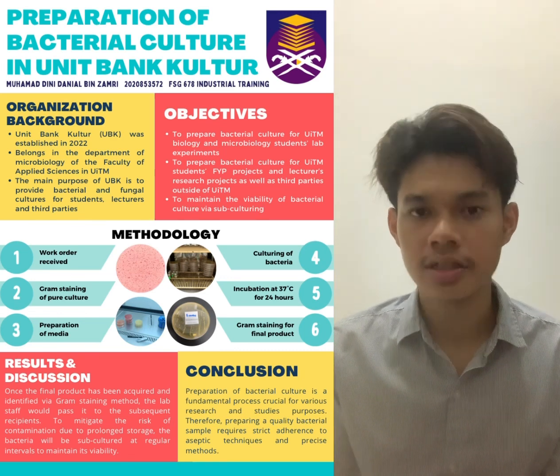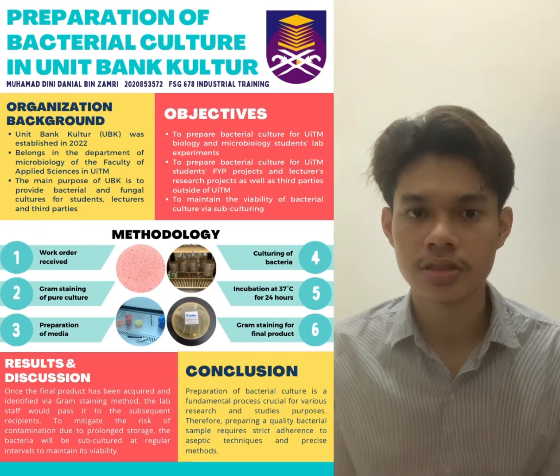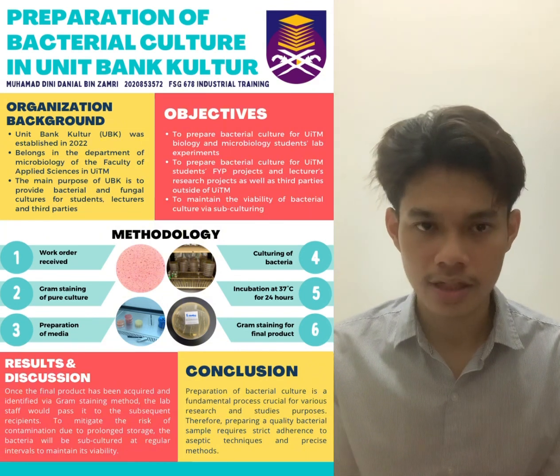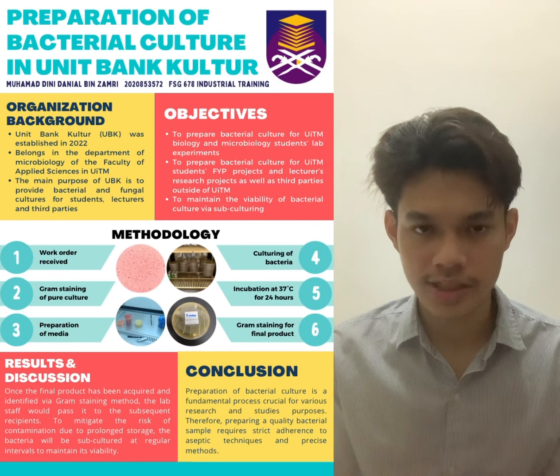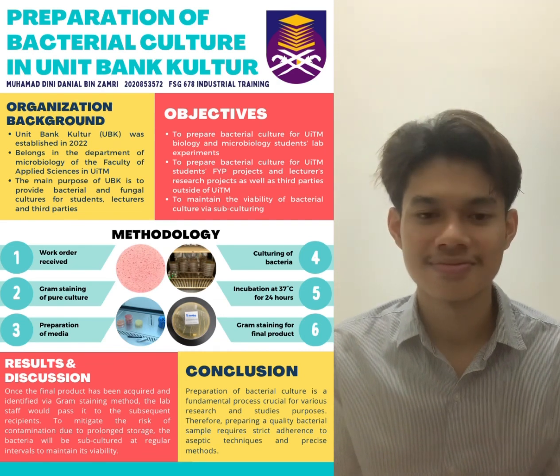In conclusion, the preparation of bacterial cultures is a fundamental process, crucial for various research and studies purposes. Therefore, preparing a quality bacterial culture requires strict adherence to aseptic techniques and precise methods. That's it from me.